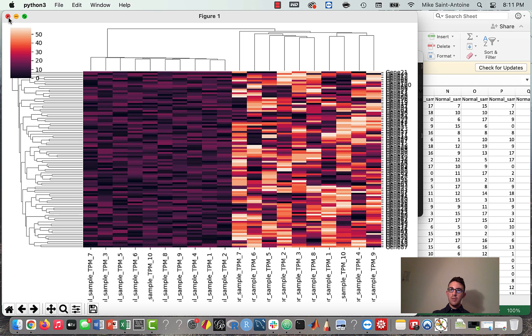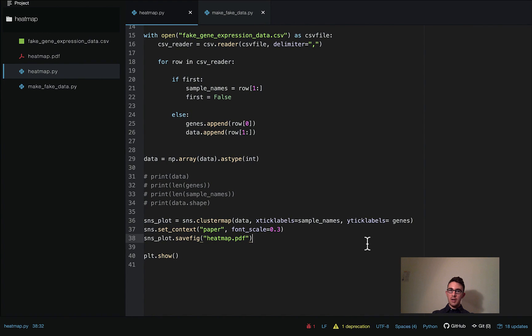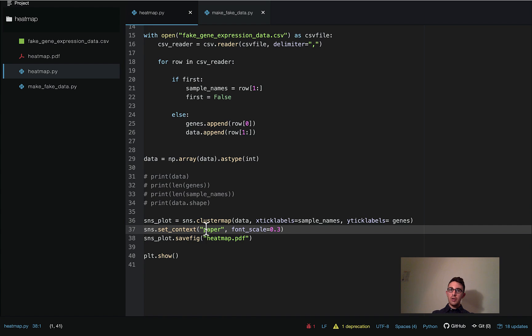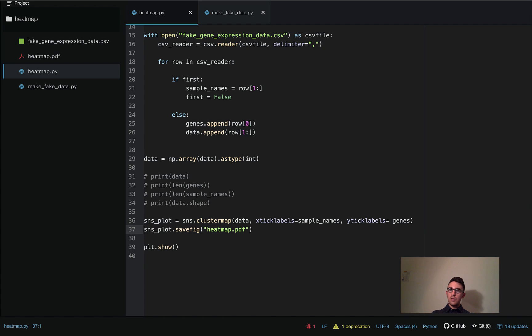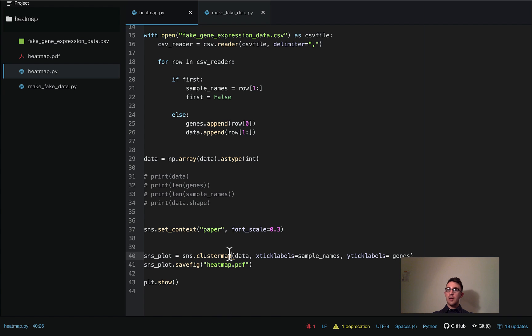Slight mistake I made — I didn't realize you have to add the `set_context` line before you actually make the plot. This should come before you actually create the plot. Of course you have to set these settings before you make the plot. Sorry about that — let me try it again.